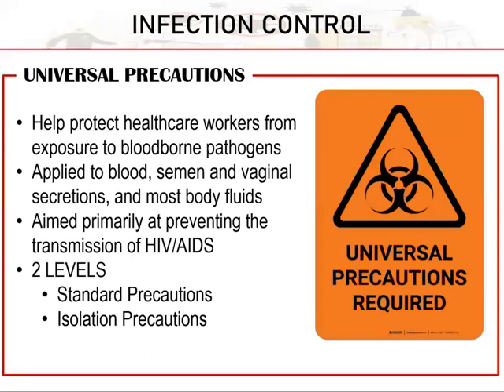It's because, class, by the time that they created universal precaution, maupod ni siya ang time na increase ang cases sa HIV. So, it is focused on blood samples na ideally makakarry og or carries the virus. So, even though it is named universal, it's not applied to most of the samples that we are processing in the laboratory.